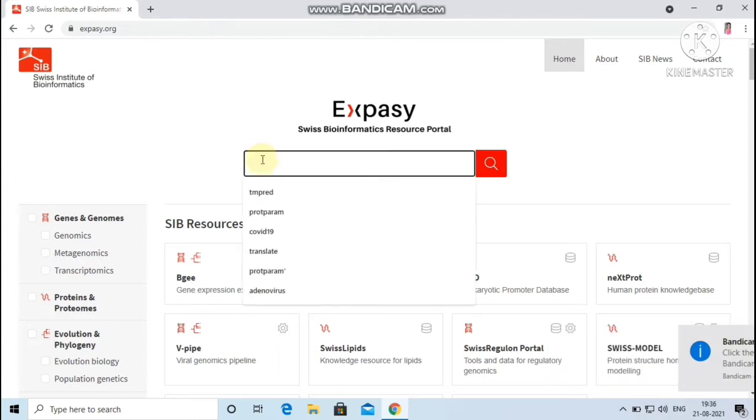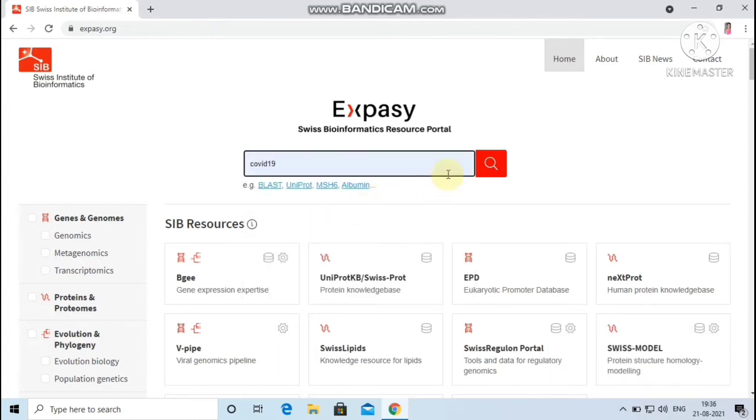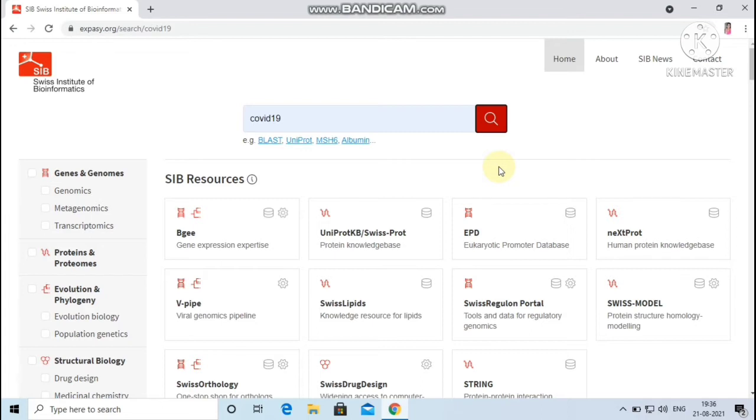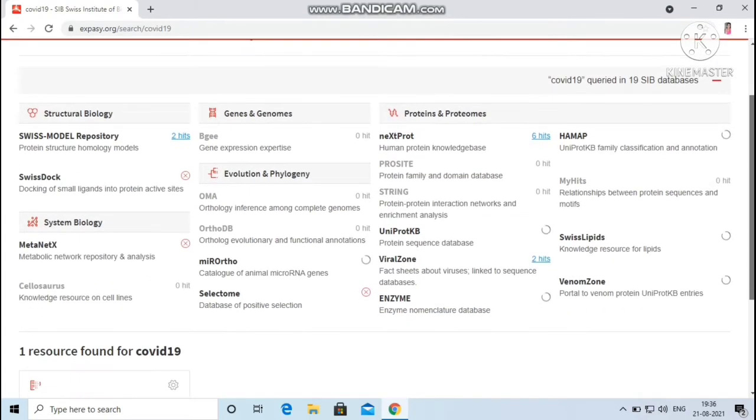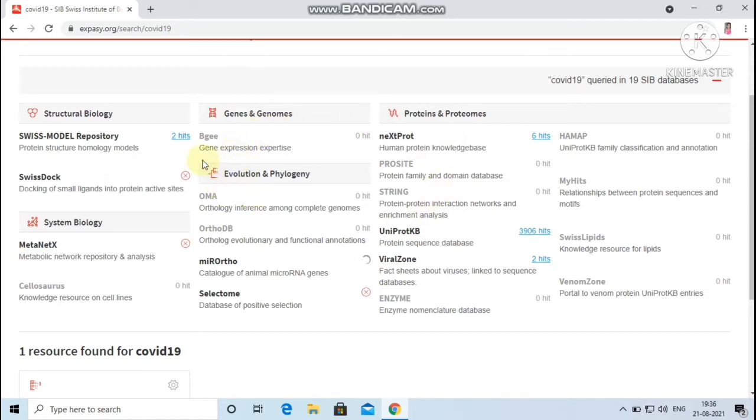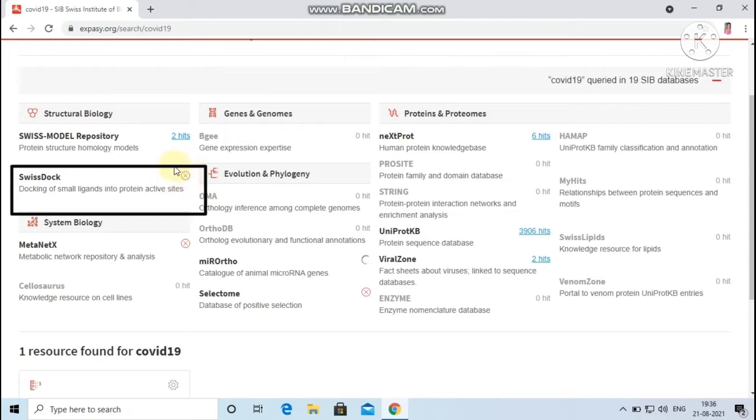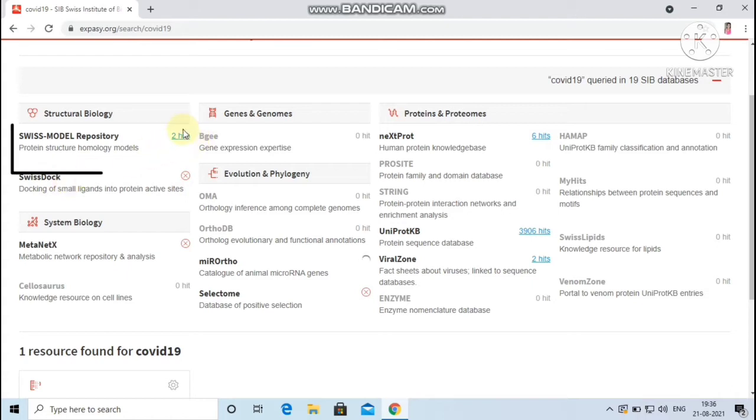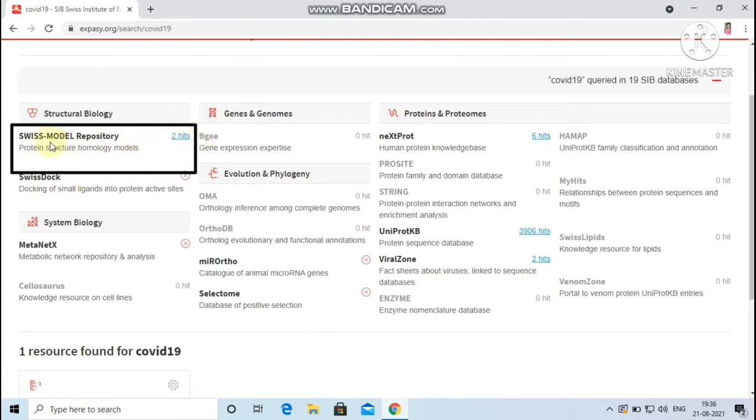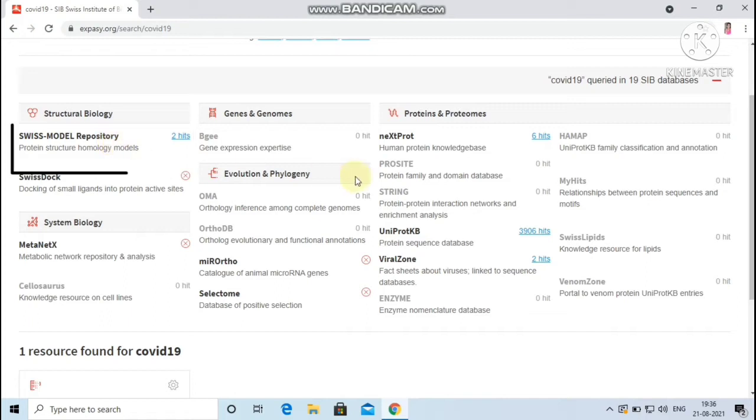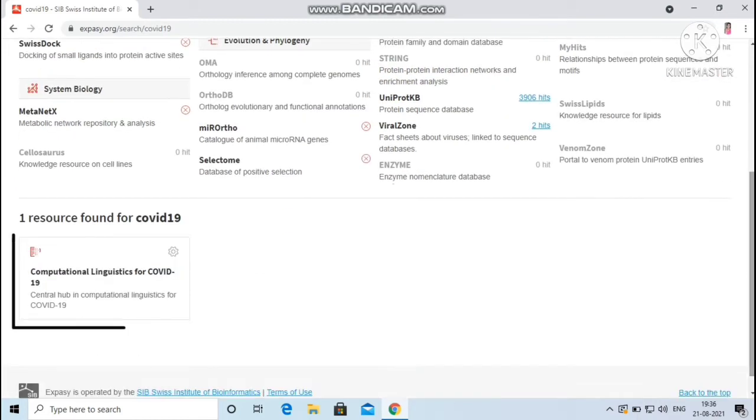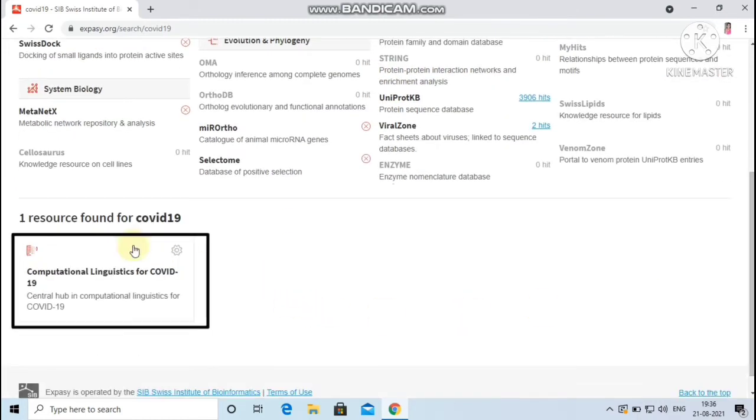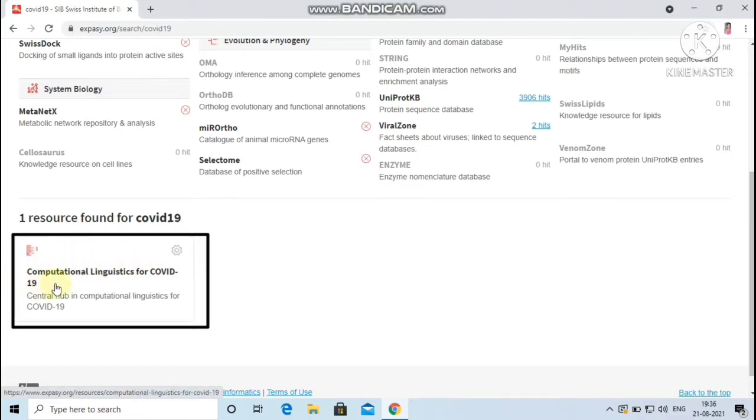For example, let me search for the keyword COVID-19. A result page provides two types of search results which are visually separated. The top of the page provides cross-resource search result with the number of hits found in each of the 19 databases. The cross mark will appear if query is meaningless with respect to that specific database. Here the two hits indicates the number of hits found in the subset of Swiss Model repository. Likewise, six hits here indicates the number of hits found in the subset of neXtProt database. The bottom of the page provides regular search results related to the keyword COVID-19. One regular search resource was found related to the COVID-19.